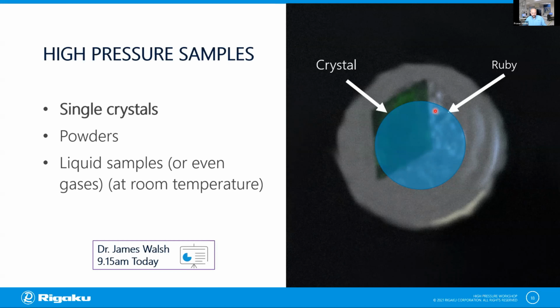So it's clearly in our interest when it's like this to mount the crystal as close to the middle as possible, but we can also center on the sample like this. And when it's like this, as we rotate the cell, you might start to see some effects like the gasket being clipped by the X-ray beam, and that will lead to some diffraction.